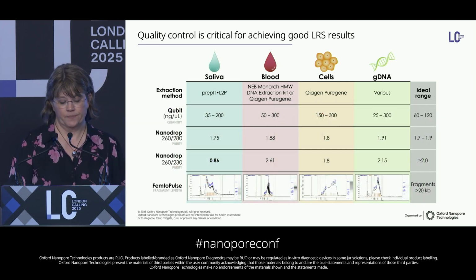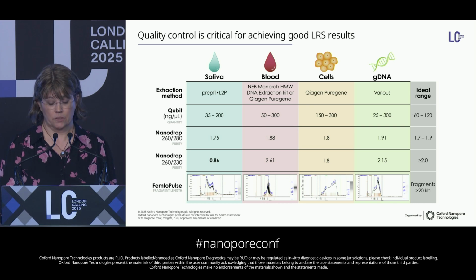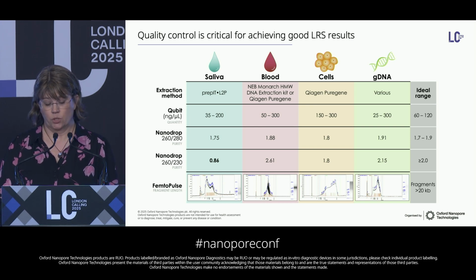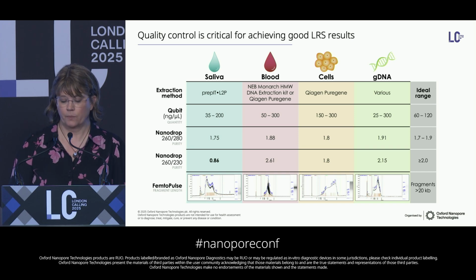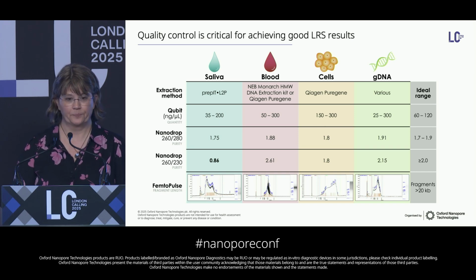Without good QC, degraded or impure samples can lead to lower yield, shorter reads, and unreliable phasing, directly affecting how well we can guide ASO design.